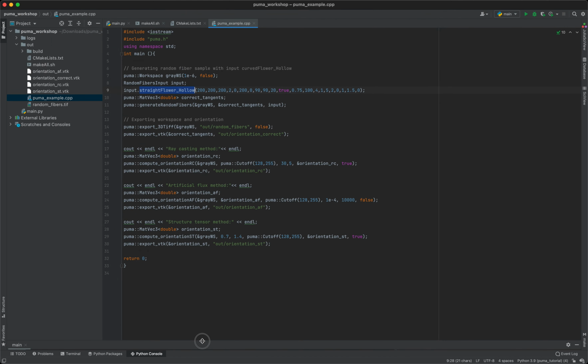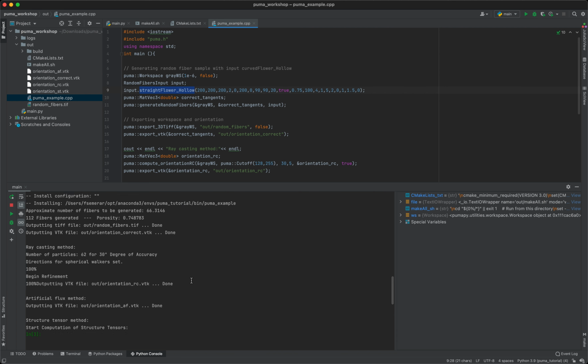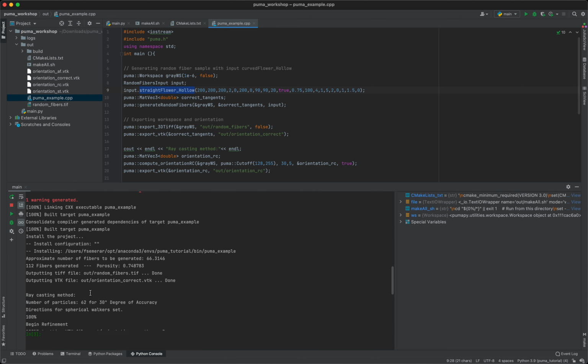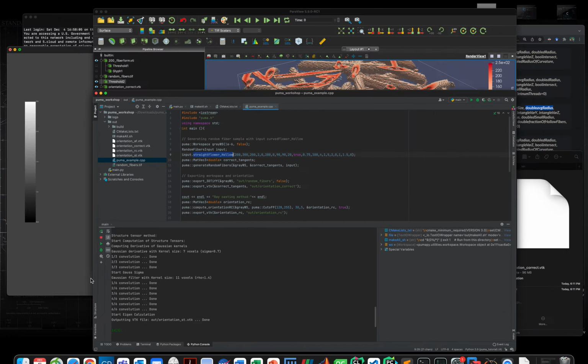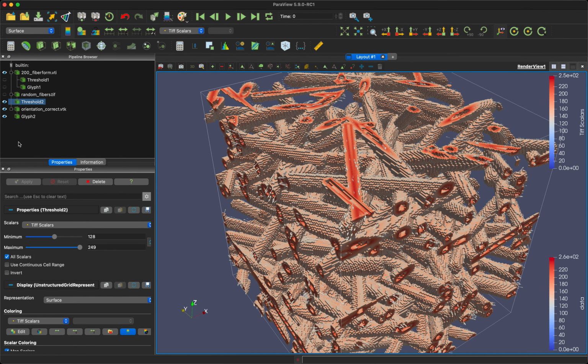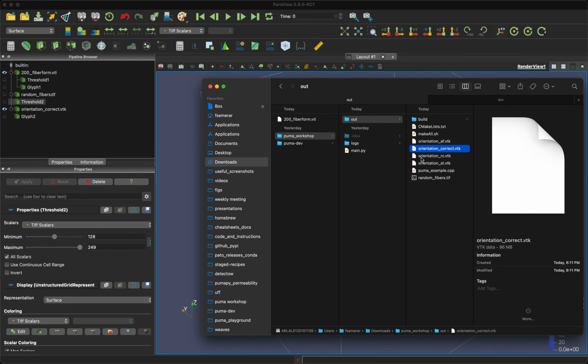So let's check. Okay, it is completed for the 3 orientation methods. As you can see, if you get this, these are only warnings. The 3 orientation methods have output the 3 orientation estimations. So we can use basically the correct analytical solution for the orientation and benchmark how the 3 methods perform. And this is what I did in one of the papers that I published.